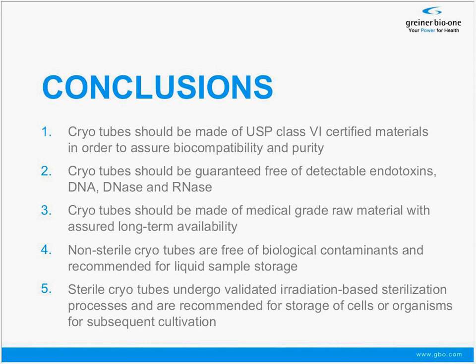Cryotubes should be made of medical grade material with assured long-term availability. And non-sterile cryotubes, which are free of biological contaminants, are recommended for liquid sample storage, whereas sterile cryotubes, which are undergoing validated irradiation-based sterilization procedures, are recommended for storage of cells or organisms for subsequent cultivation.